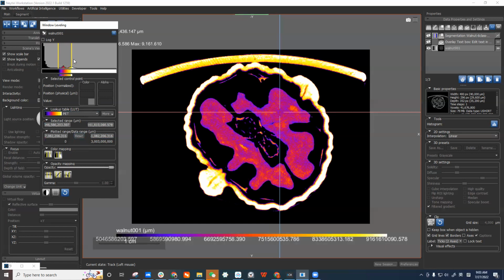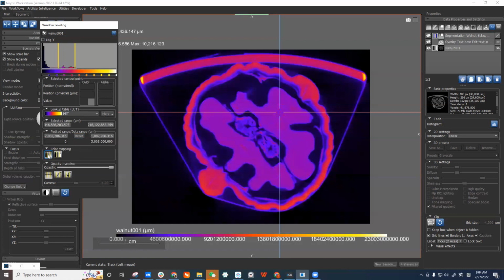And how we apply the color to the image, there are two different ways. That's what we call color mapping. The first one is the default. The first one is we map the color for the full range. You see here, this is the intensity histogram. So you see the full range of the data. For this data, the full range is from intensity 0 to 3000.